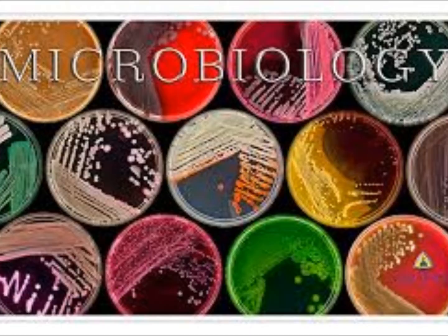That's where it gets hard, when you have to look for a tiny variation. You might see a white colony on day one, and on day two they turn into two, and you've got to say gray white, or tan white, white white, bright white. It gets a little funny, but you're just trying to look for distinguishing factors so that you and the next person know what you're talking about.